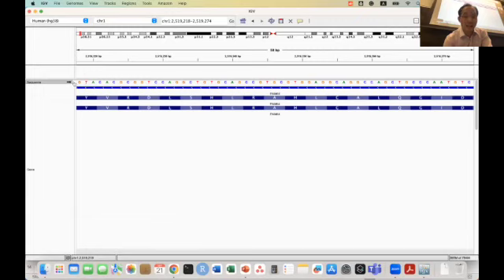It is going to be A. So it's just a complementary sequence, but you have to read from the other direction. That's why after you make a complementary, you are not reading this direction, you are reading the opposite direction, GCA. So directionality, you have to take care of it. But the complementary base is automatically done when you press the arrow.